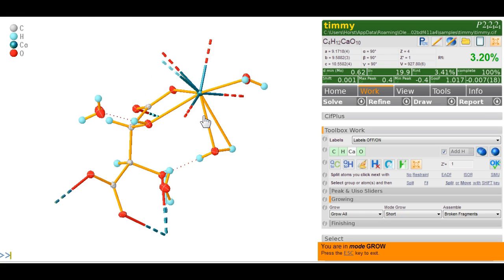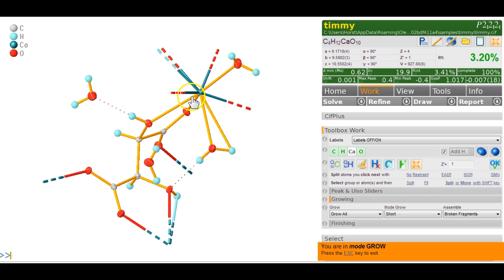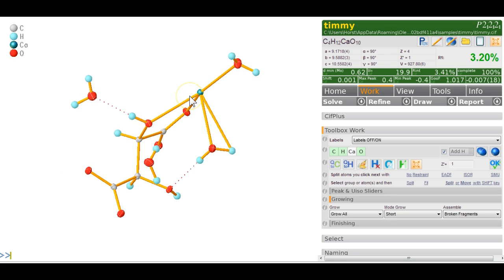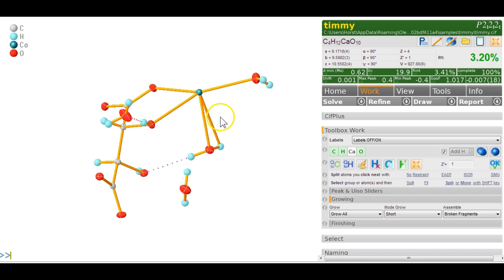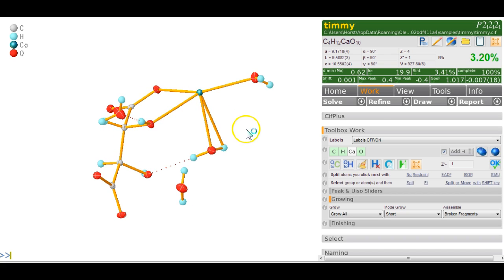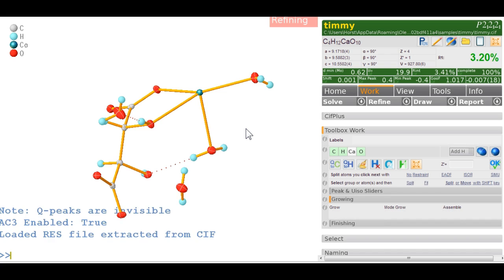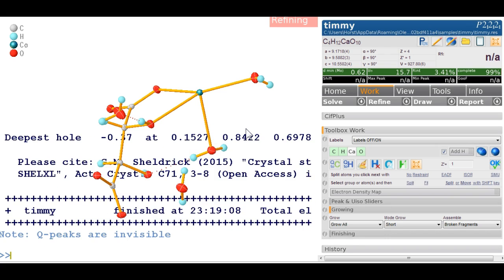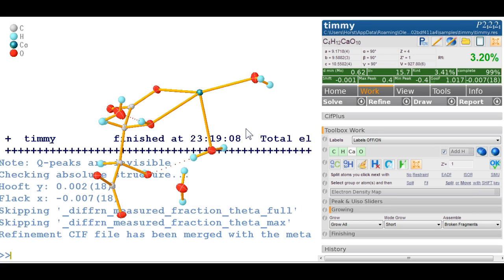First, I type fuse again and hit escape to get out of this mode. You can see there is a spurious bond between this metal and that hydrogen. One way to deal with this is con dollar m, so all metals will have a connectivity of no more than seven. Now we don't see those bonds anymore. If I refine this structure now with Control R, the bonds will stay disappeared.